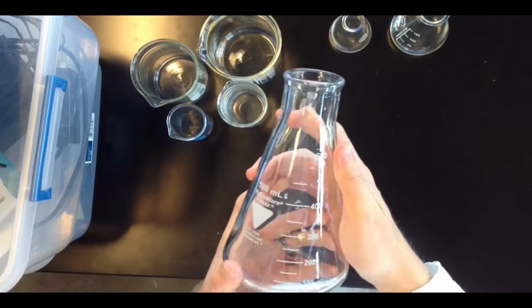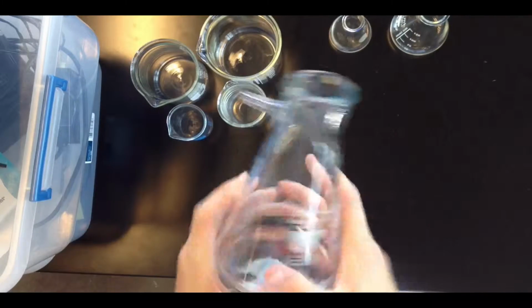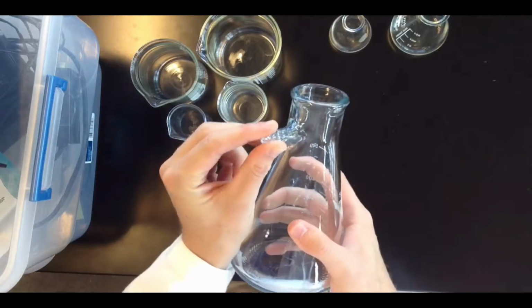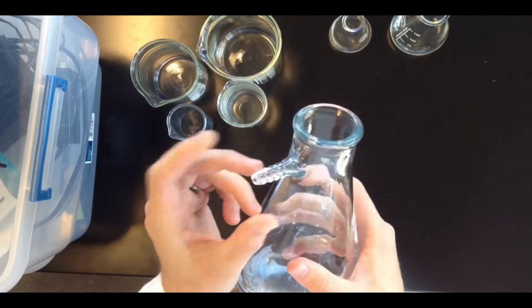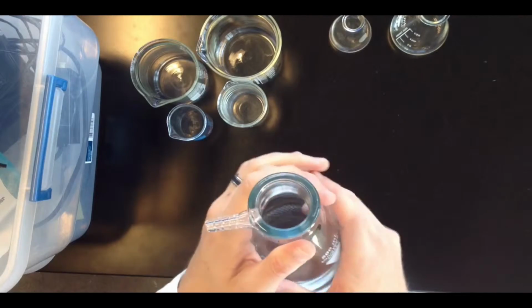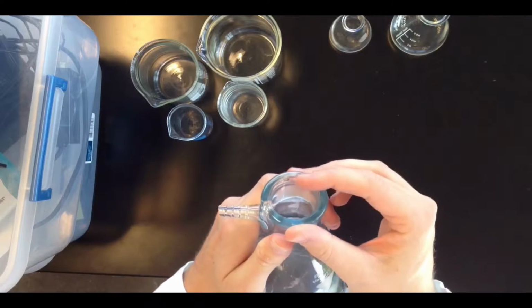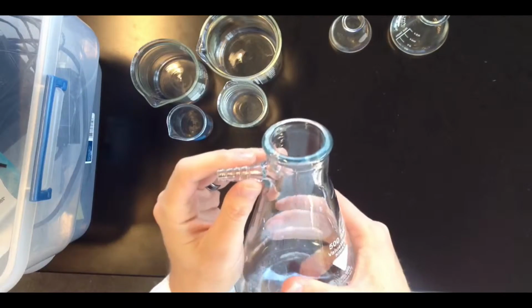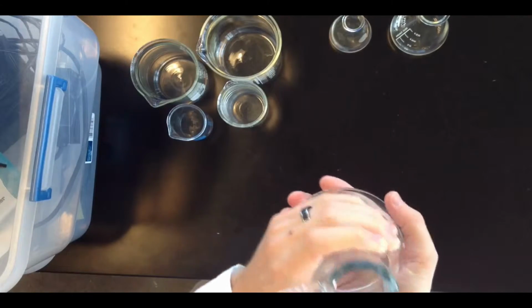Now, very similar in appearance to the Erlenmeyer flask, but very different in function, is the filter flask. It again has these approximate volumetric markings, but you'll notice on the filter flask that it has a little spout on the side. And this actually connects to your vacuum spout, which is on your lab bench, and this can be used to filter liquids. So you'll see in the video on funnels that there's a funnel that fits right into the opening of the filter flask, and we can use that to filter mixtures of solids and liquids to separate the solid, which stays in the funnel on top, from the liquid, which ends up in the bottom of the flask.